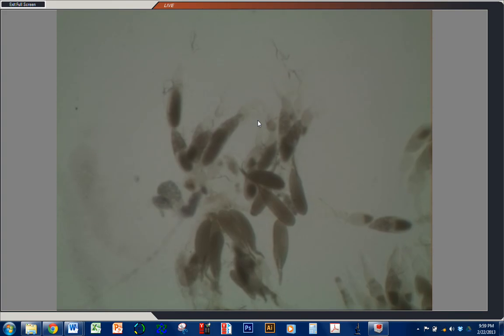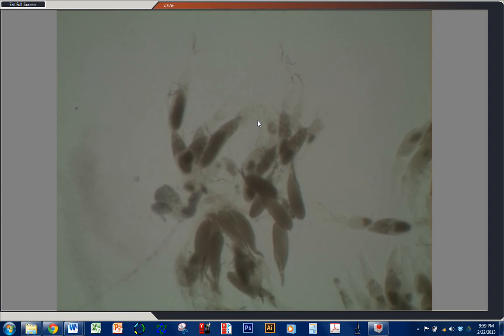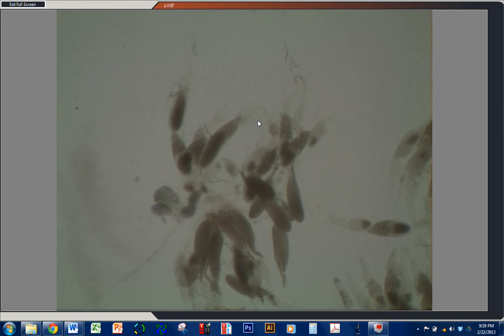All righty, so that's dissecting ovaries. The next step is to fix them. So what we're going to do is pick these up and put them into a solution of 4% formaldehyde, fix them for 20 minutes, and then wash them, and they're ready to begin the immunohistochemistry process.